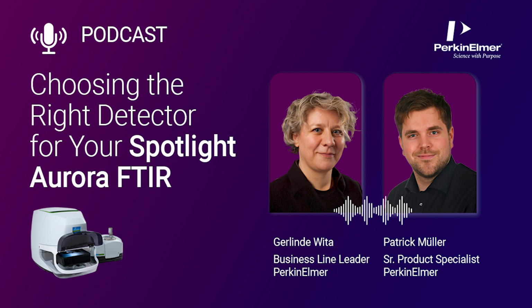Thanks a lot, Patrick. So, as I understand, it is very important to decide on the best detector to really get the best results for any application.